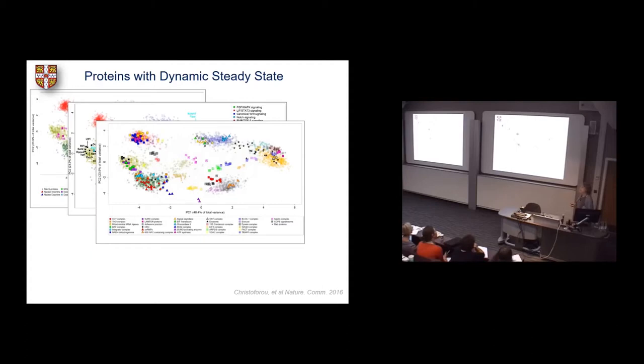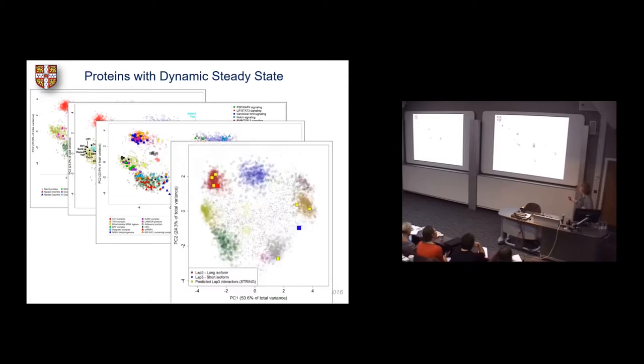We can also see proteins in complex. We don't do anything to cross-link to keep our proteins together, but you can also see where you have very stable complexes that members of the components of the complex sit on top of one another. Down here, for example, in yellow, we've got components of EIF3, which is involved in translation.